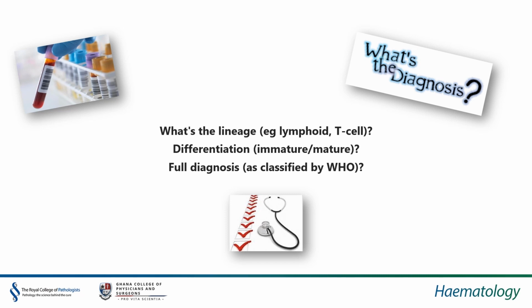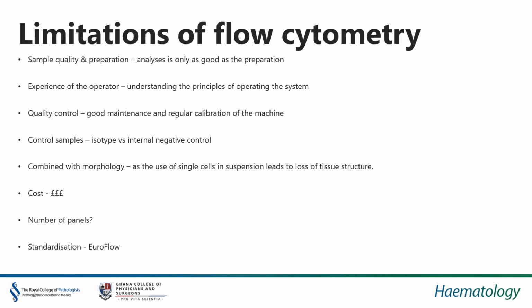So that just shows the integrated approach that we need to have for these acute leukemias, in which flow cytometry just plays a very, very small part. So let's cover some of the limitations of flow cytometry.